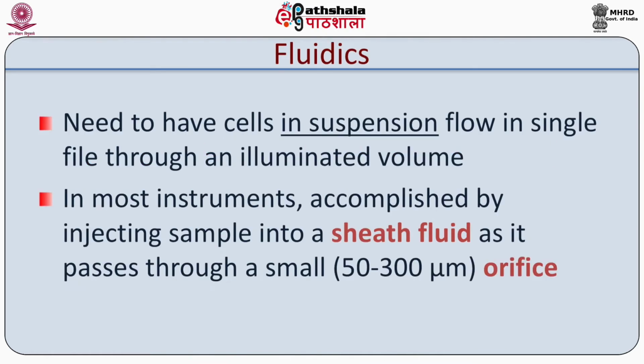The important thing to know about fluidics is that fluidics functions to transport cells in a single suspension to the beam of light for illumination and interrogation. Single cell suspension is the key here. The clusters, if present in this stream, can result in erroneous measurements. The detector will not distinguish between a cluster versus a single cell. It will treat each cell or a cluster as a single particle.